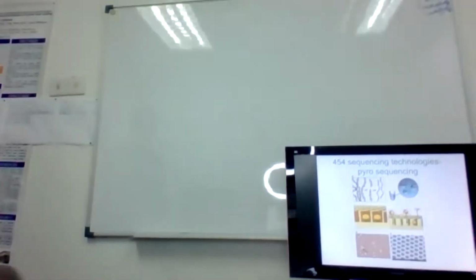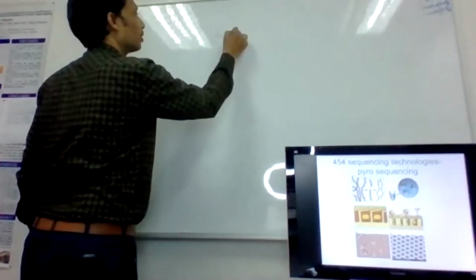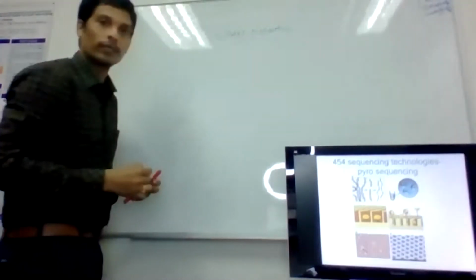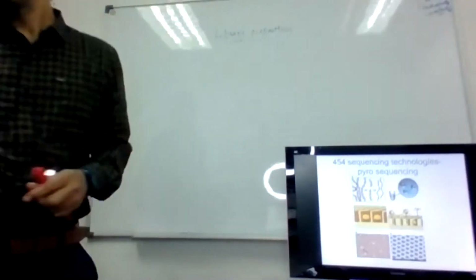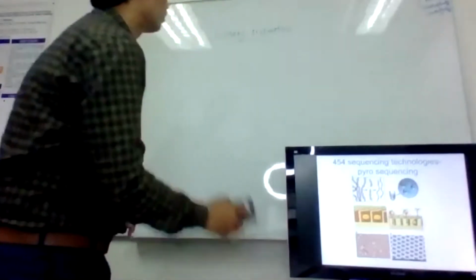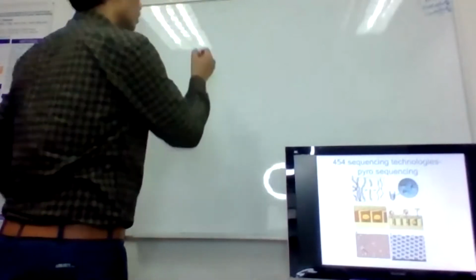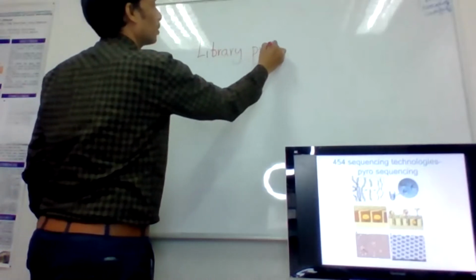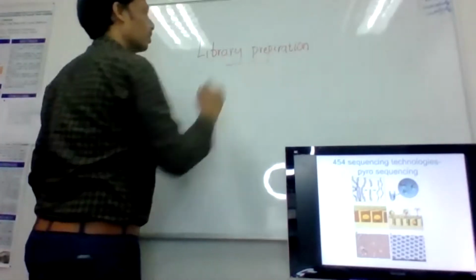We need to do the library preparation. See here. Okay, you can see it.